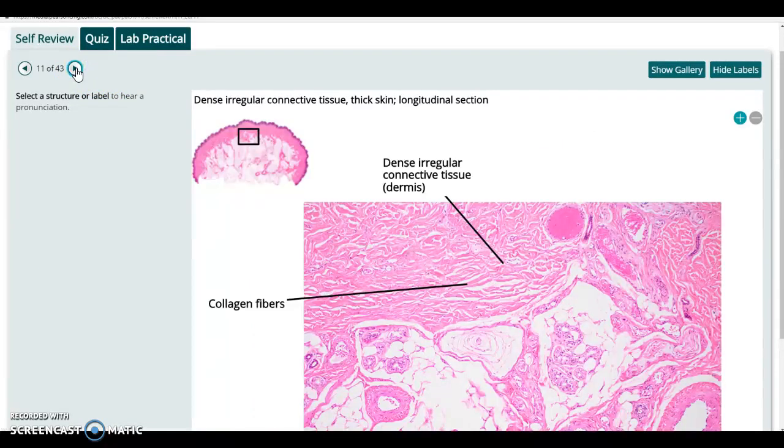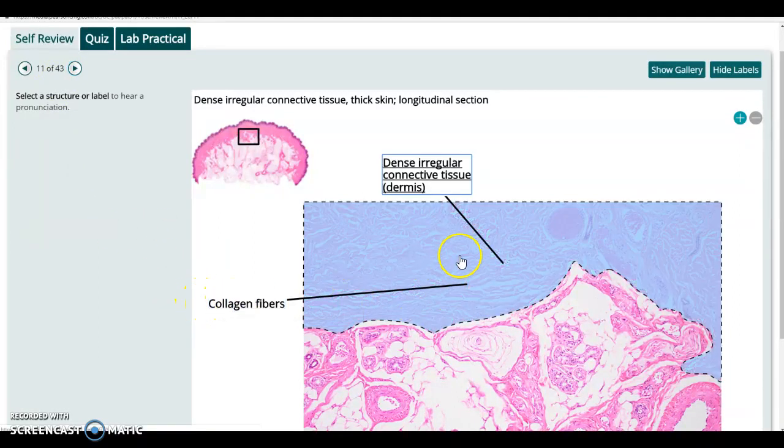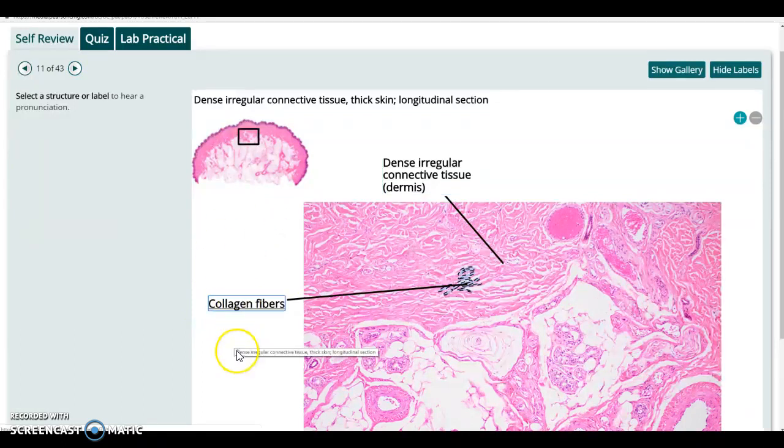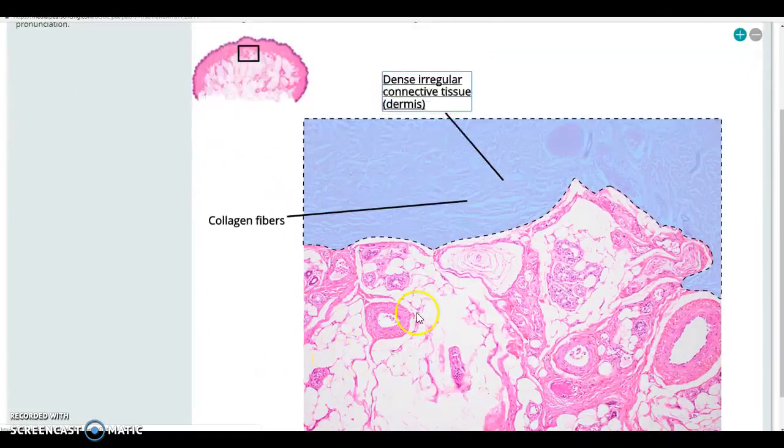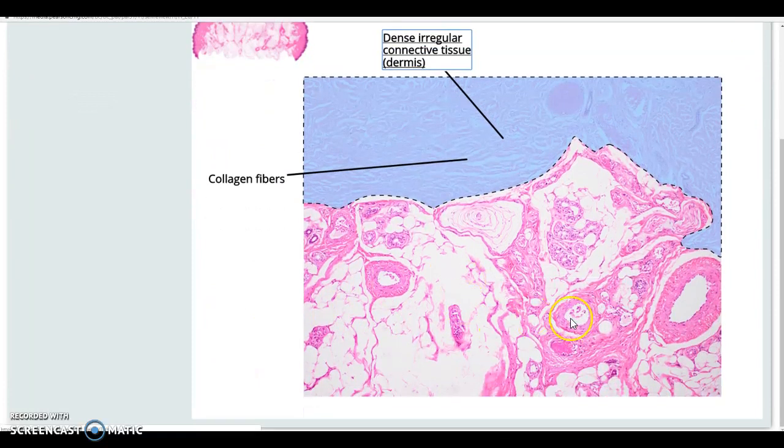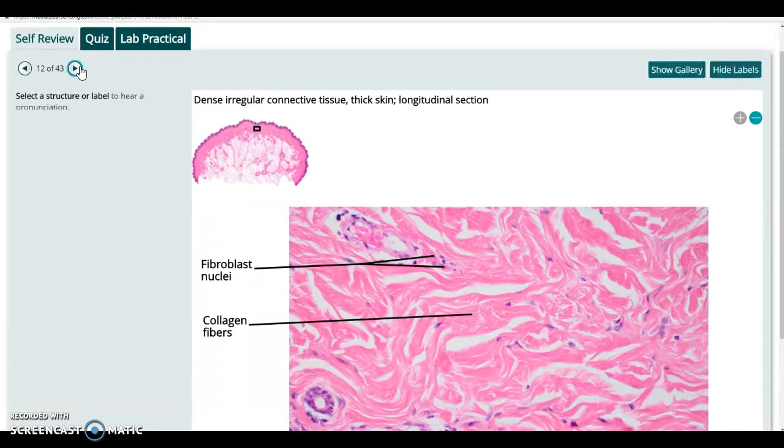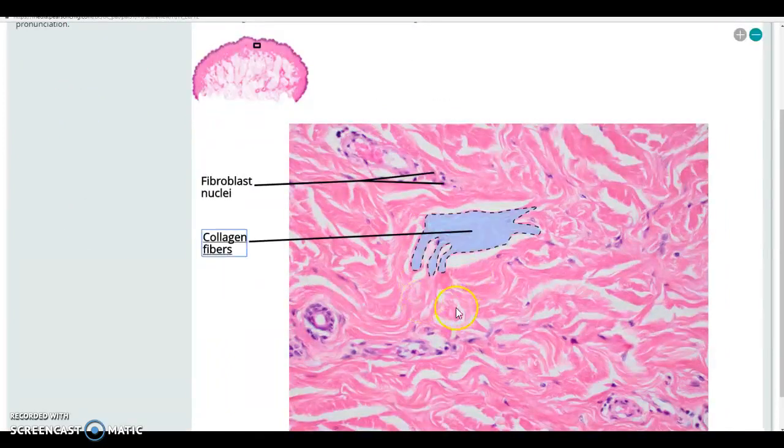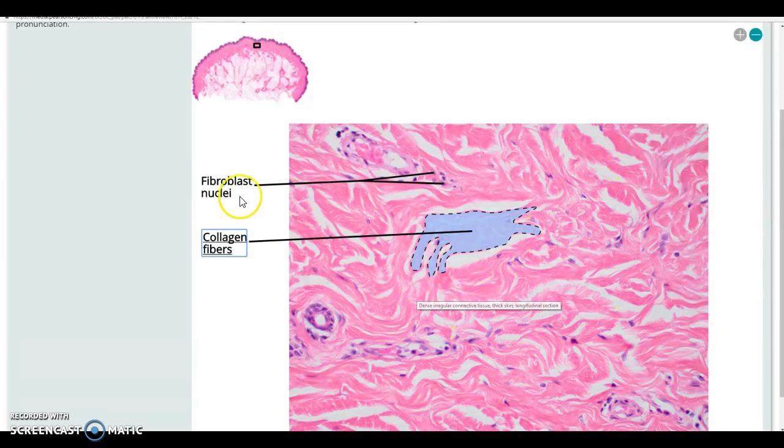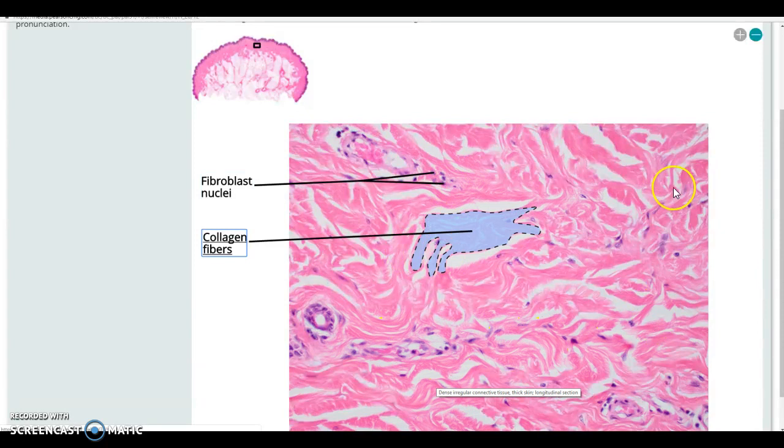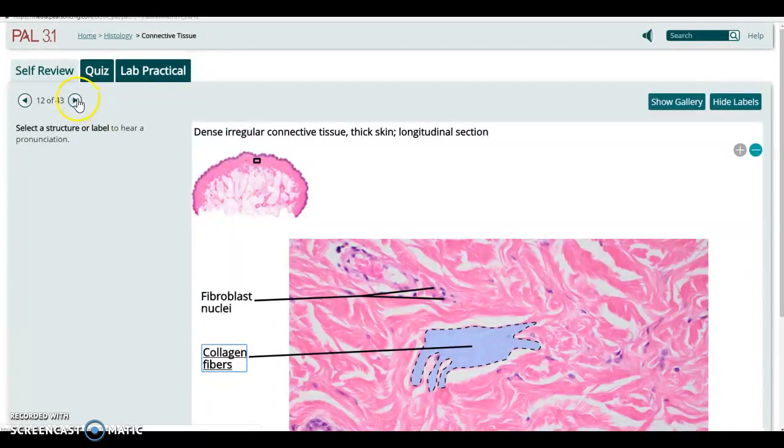This is dense irregular connective tissue. This is the skin, but we would pay attention to this now just as a best example of that dense irregular connective tissue. There you can see all the collagen fibers that pretty much fill the whole tissue as you can see. And of course, this part down here is the underlying adipose tissue supporting nerves and blood vessels. This is just a nicer up close view of those dense irregular collagen fibers all spread out throughout here and all of the fibroblasts throughout here. When they say nuclei, that's what stains, but you can really think about those as the entire fibroblast cell. That's what's on your wish list.